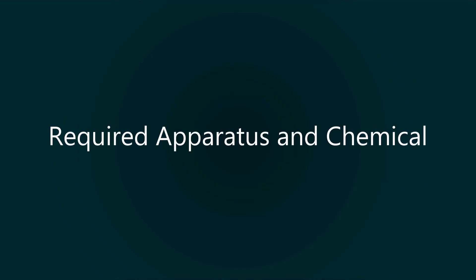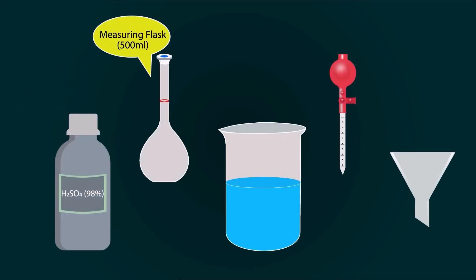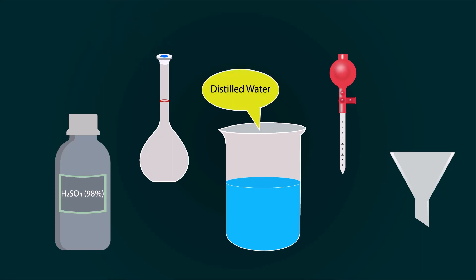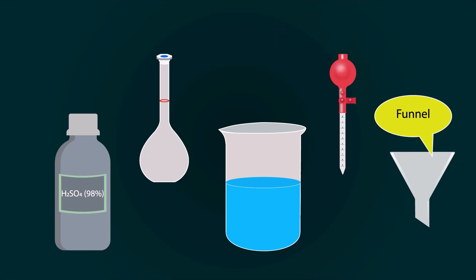Required apparatus and chemicals for this process are: 98% sulfuric acid, a volumetric flask of 500 ml, distilled water in a beaker, a pipette, and a funnel.